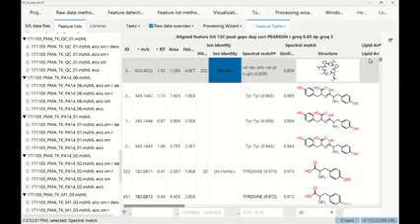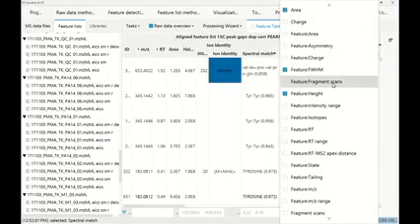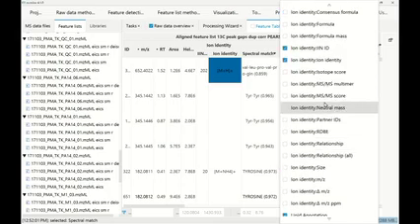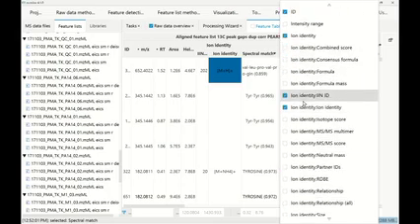And for the ion identities, there's also some additional information, so we can just click on the plus here on the side. We can scroll down and there's ion identity, and you can see there's a lot more information. Of course, in a table it's always quite hard to decide what to show to everyone, because everyone's interested in different things, but you can activate any of those columns, and also you can access them in MZmine.